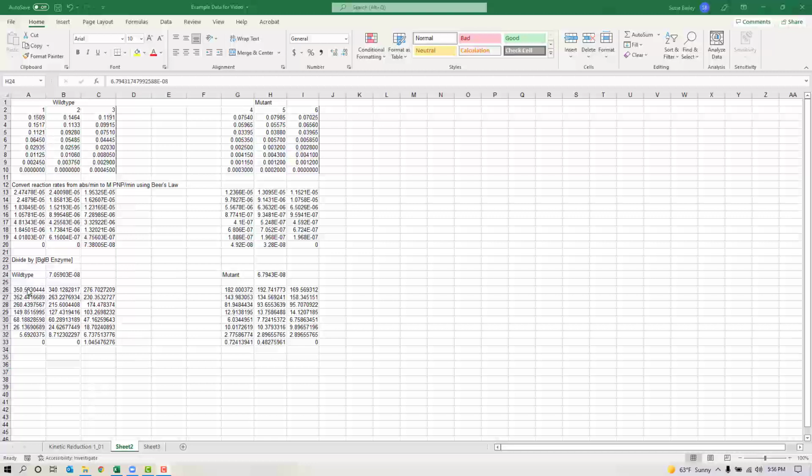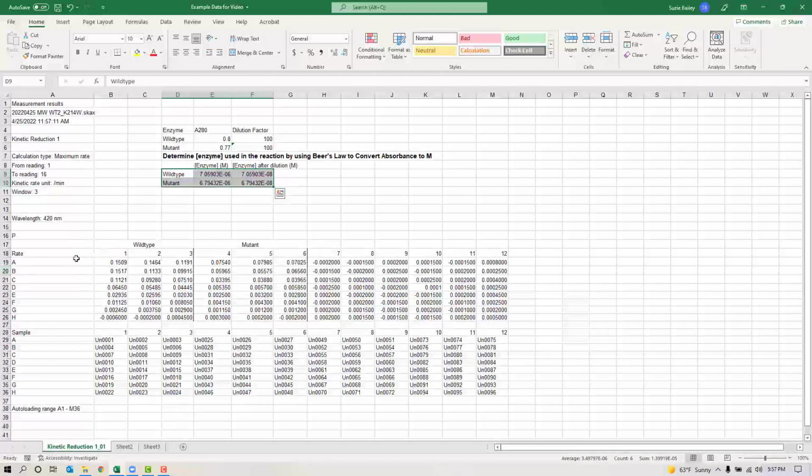Okay, so now I'm ready to average my reaction rates for my triplicate data points. So remember that we carried out our enzyme reaction at decreasing substrate concentrations as we went down. So if we go back to this that shows all of the values obtained in our 96 well plate, remember that we had rows A through H and then columns 1 through 12. What differed between row A, B, C, D, all the way down to H is the substrate concentration that we provided to the enzyme. In row H, we provided 0 millimolar substrate, no substrate was provided, right?